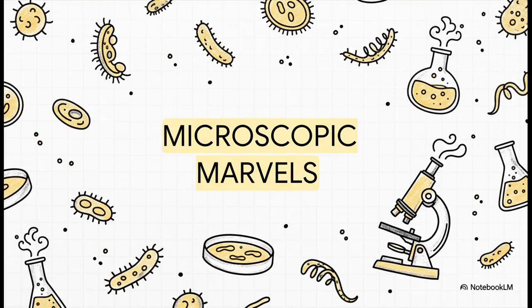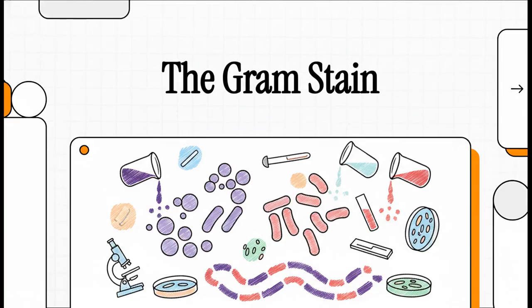Welcome to Microscopic Marvels. All right, let's jump right in. Today, we're going to tackle one of the most fundamental, most powerful tools in all of microbiology, the gram stain.